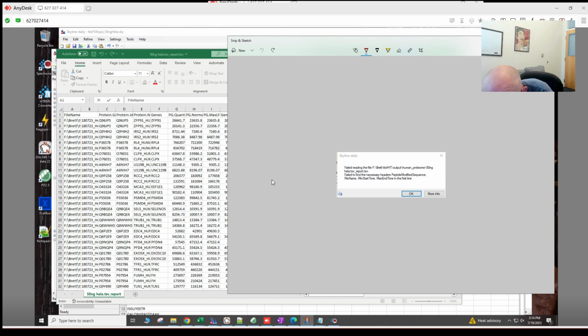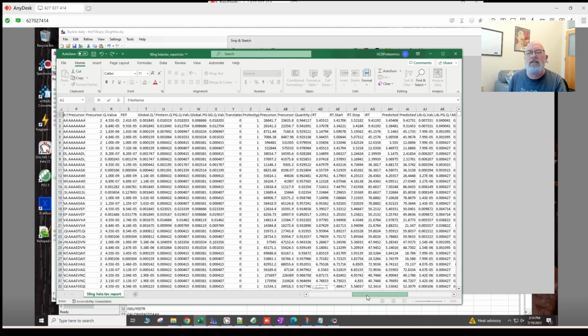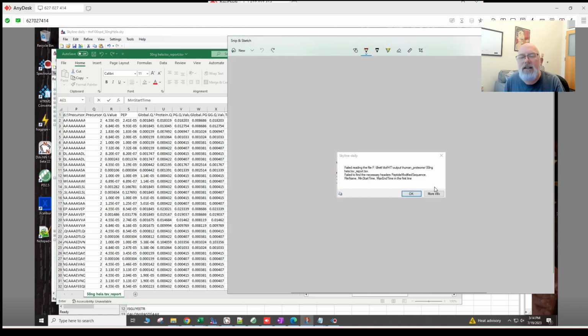I think so. No, maybe. Min start time, I would say no. Let's go see min start time. I believe that's here. Min start time. Let's see if this works. Min start time. Did I do that right?